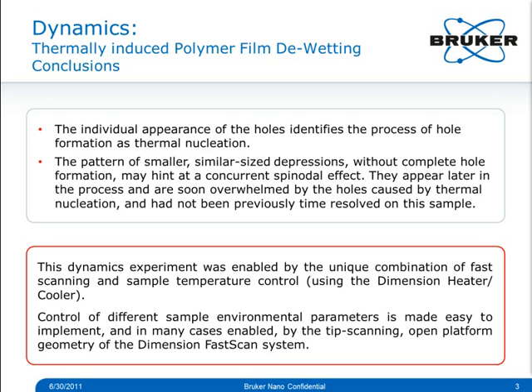However, the collaborator, while we did this measurement, also noticed the pattern of smaller, all similar sized depressions without complete hole formation, which may hint at a concurrent spinodal effect. This is still under investigation. They appear later in the process and are soon overwhelmed by the holes caused by the thermal nucleation. And so they had not been previously time resolved on the sample.